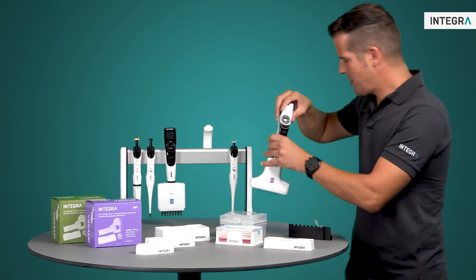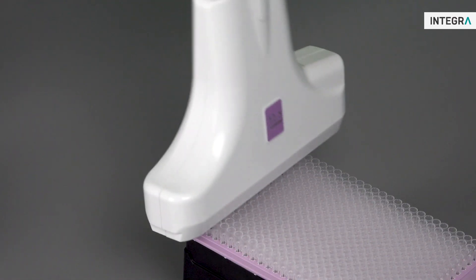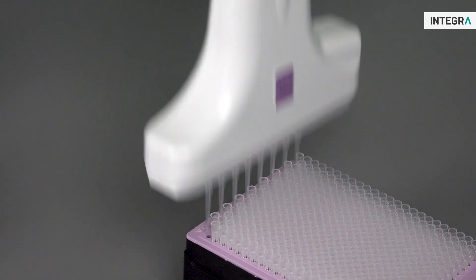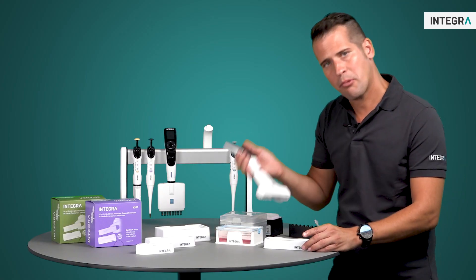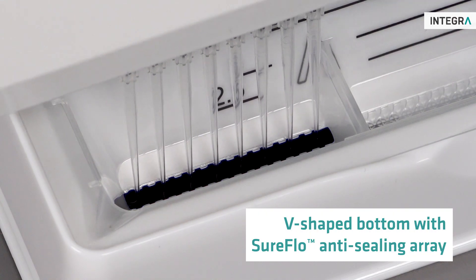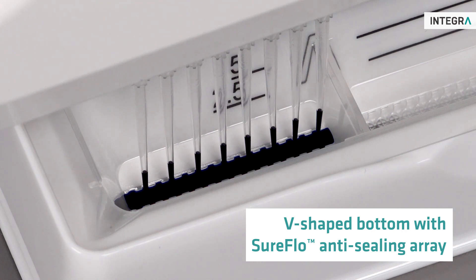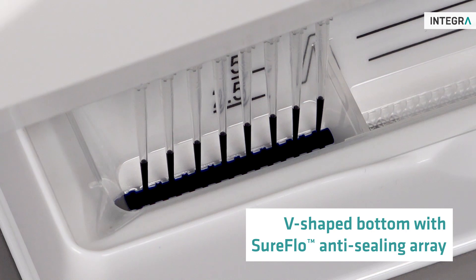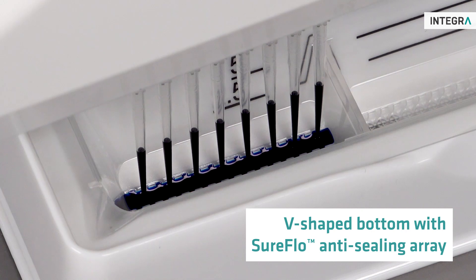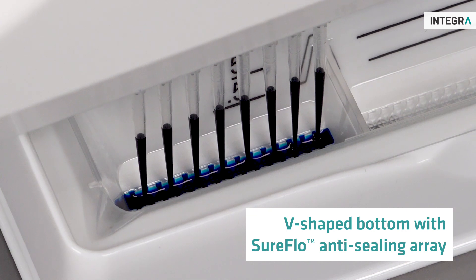Then, using a Voyager electronic pipette and low retention tips, I'll aspirate the solution back into the 8 channels. To reduce the dead volume, not only is the bottom ridge V-shaped, but it also has the patented SureFlow anti-sealing array. This allows the tips to aspirate from the very bottom of the reservoir and ensures that the liquid is evenly distributed throughout the SureFlow microchannels. By pipetting slowly, we're ensuring the liquid flows evenly through the microchannels.